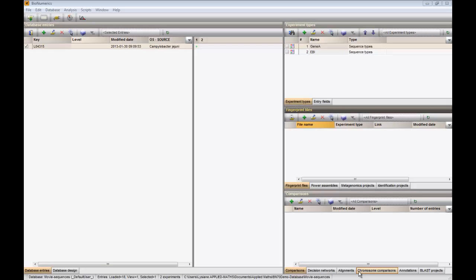In this video, we will process a contig assembly project and save the consensus sequence in the Bionumerics database.